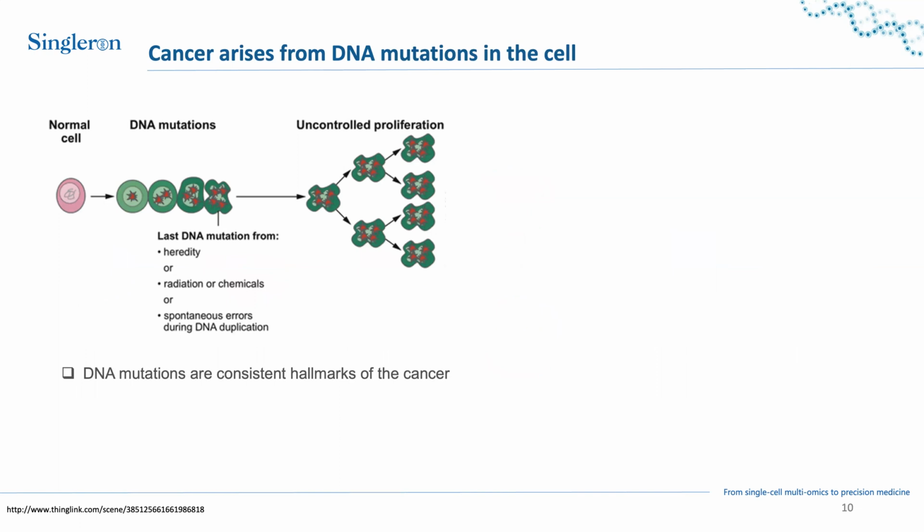I brought two examples of how FocuSCOPE can be used. The first one is FocuSCOPE for lung cancer. A brief introduction: cancer in general arises from DNA mutations in the cell, which are acquired during the lifespan of a person.